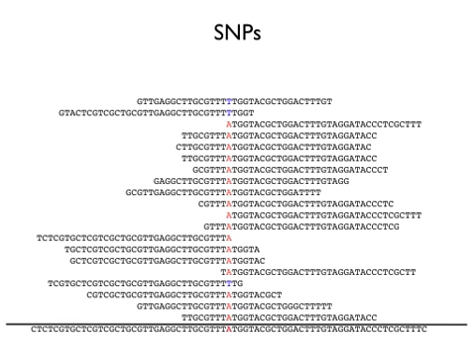Okay, so how does it happen? So here's that location, and you can see that the A is the reference, and we have T's. We have enough T's that we might consider this to be a SNP. There's no C's, there's no G's, there's just A's and T's, and this data that I'm showing you, if you put it through one of the SNP callers, says that's a SNP. But this particular data set was from a bacteria that was supposed to be homozygous everywhere. No heterozygous anything. So we know this is a false positive.